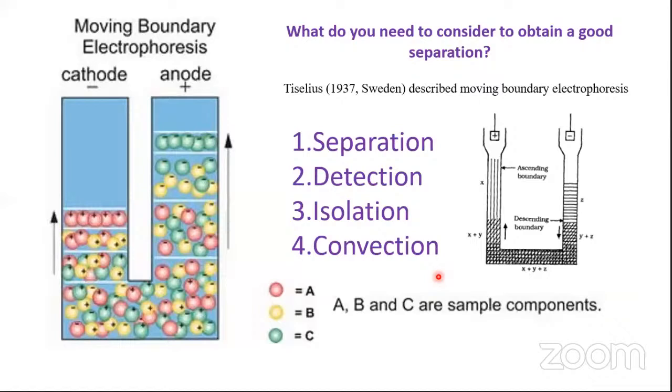You are going to take a neutral solvent, say water, which is uncharged otherwise. But when they get energized, they start colliding with other solvent molecules which are not heated maximally, and that leads to setting the solvent in motion to a certain extent.